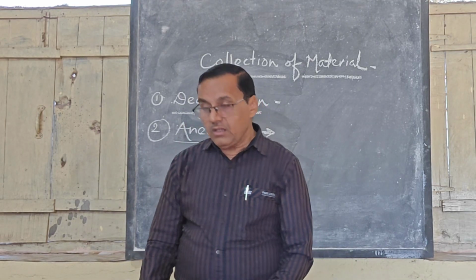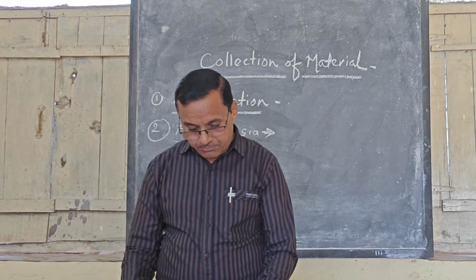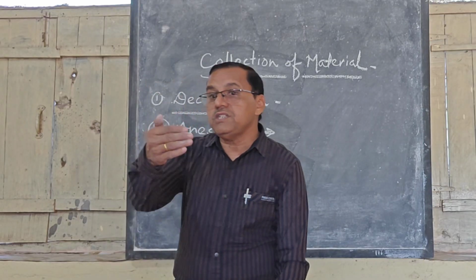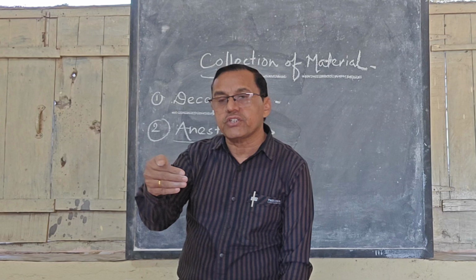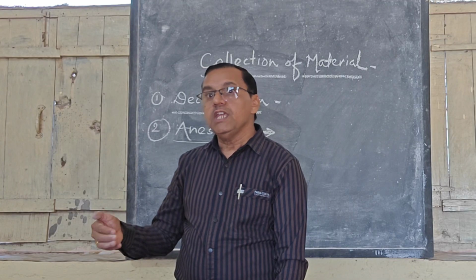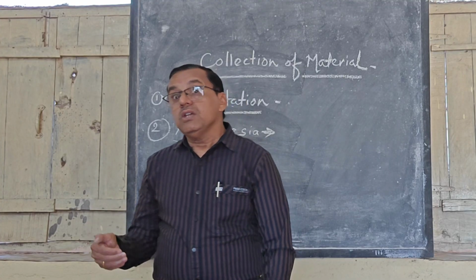Generally, for a few animals physiological saline solution is also used for dissection purposes. Marine invertebrates are dissected in marine water, and the tissue is immediately removed from the animal. The tissue which you have to study, for example if you have to study the liver, then remove the liver from that organism. If you have to study the stomach, then remove the stomach from this animal. It should be done immediately.